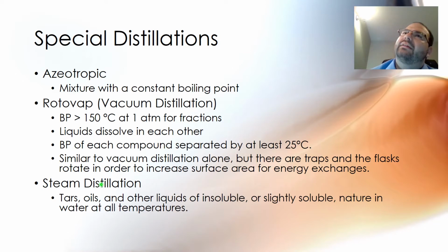And then what's going on is you can angle most of them now, not all of them. It depends on how old they are, and some of them have mechanical parts and some of them are more automated. Most of them are automated now. But you can rotate that whole apparatus around and get the angle of that flask into the water bath.